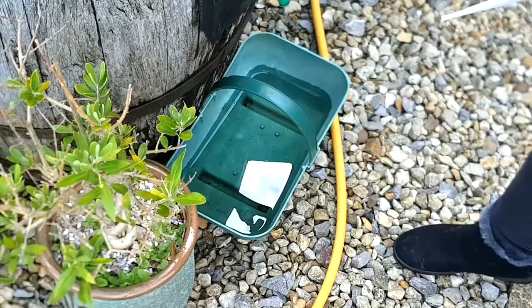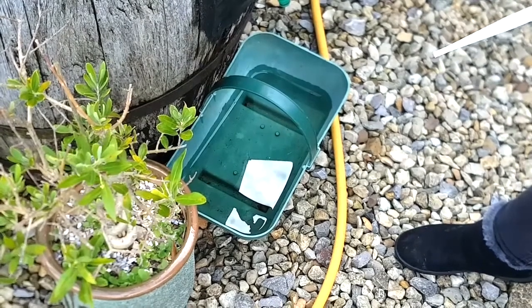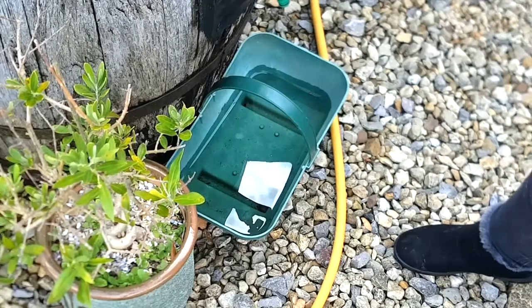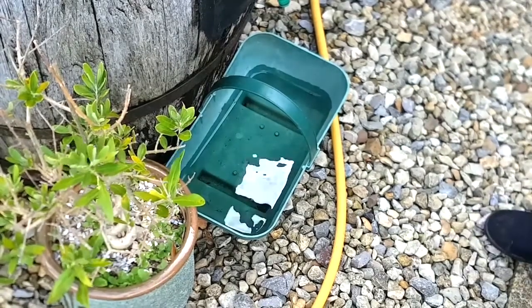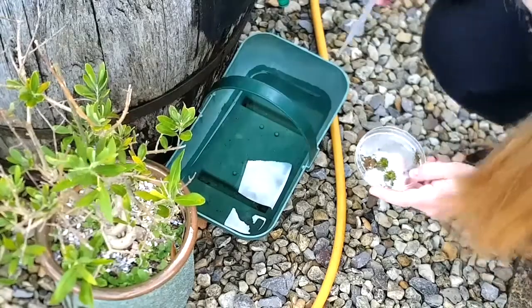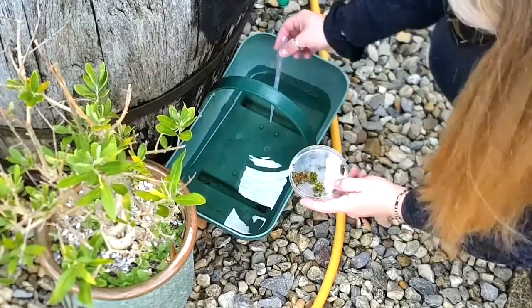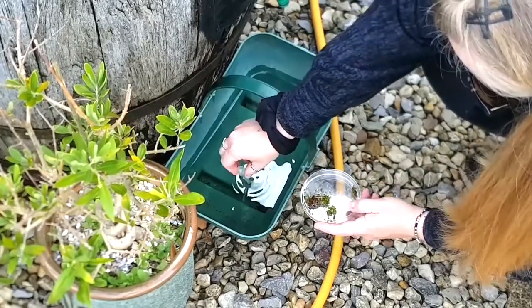You need to rehydrate the sample, but don't use tap water. Tardigrades are extremely hardy and can survive all kinds of extreme conditions, but chlorine in tap water is really not very good for them. So instead, I'm going to use rainwater. Fortunately, it poured down here yesterday, so this is how much rain we've had in the last couple of days. There will actually be microorganisms in this water already, but I'm just going to scoop a bit up with a pipette and just rehydrate all of this moss.